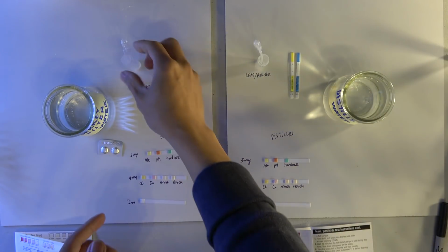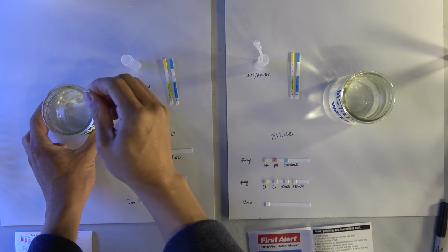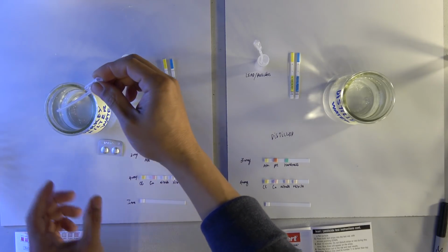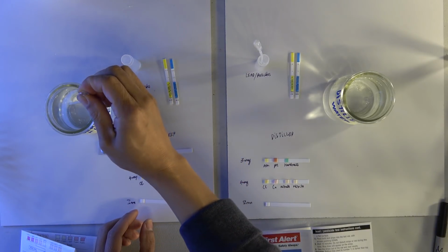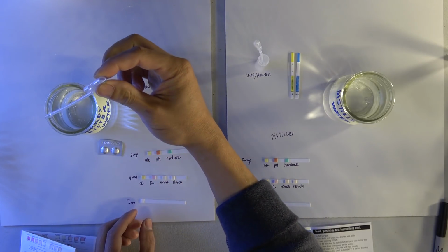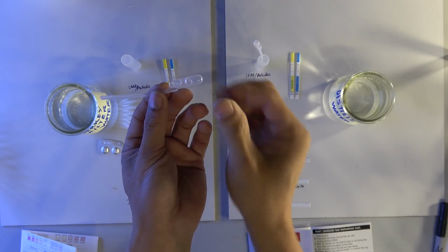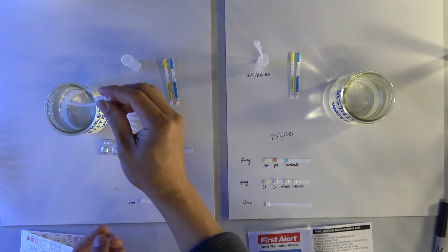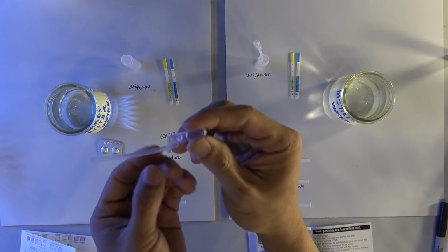Now 1 dropper full on this side, on the Berkey filter. So squeeze and suck it up. Let me see how much I can get, but it doesn't look like much. Let me try again. Okay, so it sucks water up to the first bubble. There are 2 bubbles, so I guess up to the first bubble. Let me try again. Yep, so only up to the first bubble.